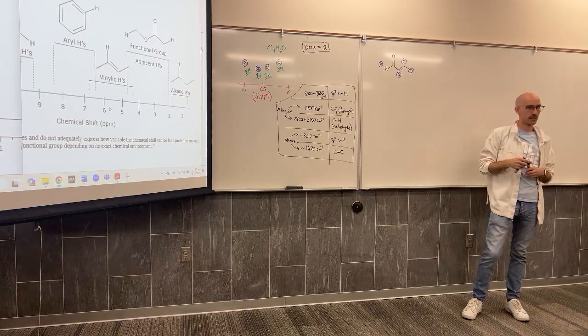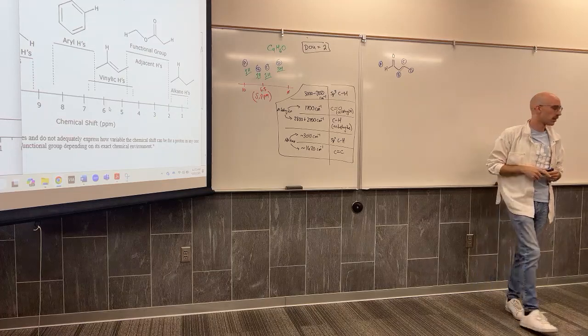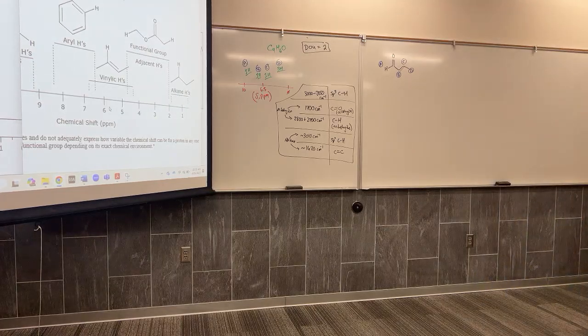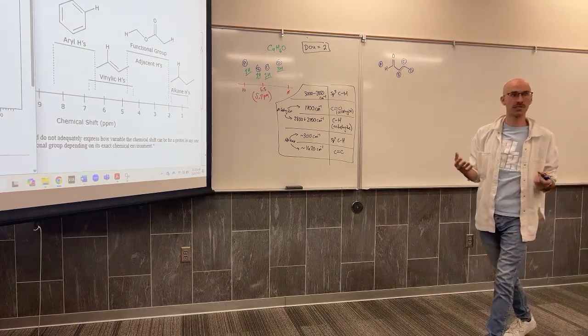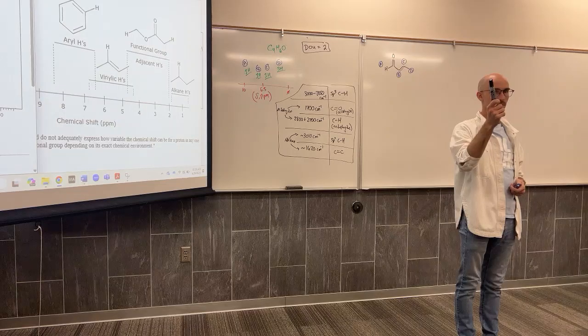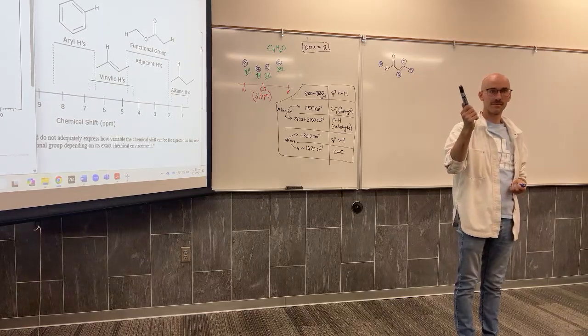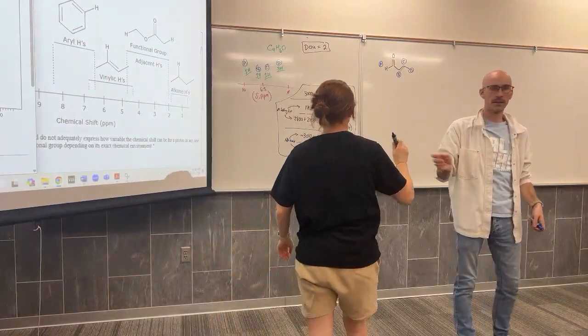Okay, what do you guys think? Can you predict a molecular ion for that compound? We're not looking at its mass spectrum, but could you predict a molecular ion for that spectrum? Looking at the mass spectrum doesn't tell you anything that you need to know about a molecular ion. Anybody? I'll do it. Draw a plausible molecular ion for this compound.